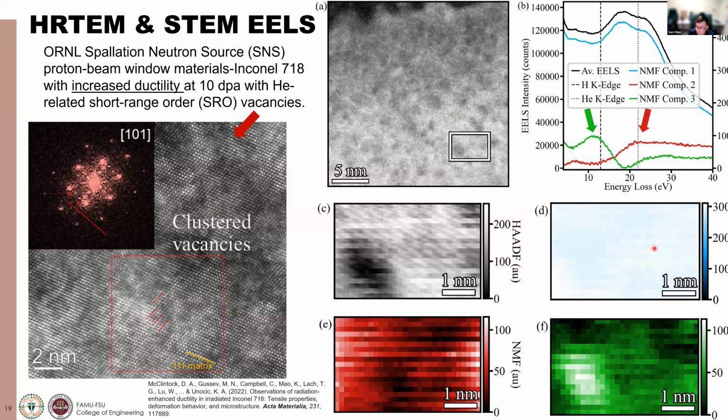The challenge here is that the hydrogen and helium are near the plasmon peak. So what you are trying to target is showing high resolution details in this type of analysis, and by filtering the background, you'll be able to reveal these features.